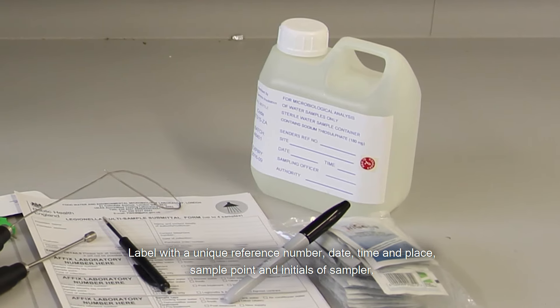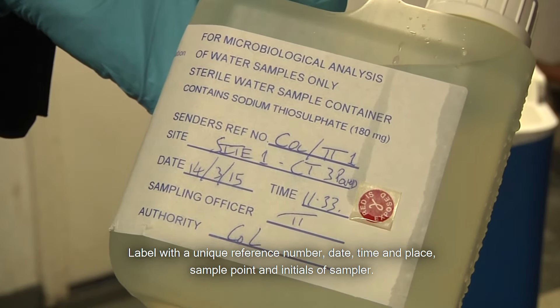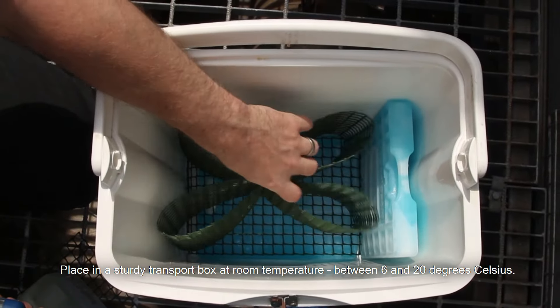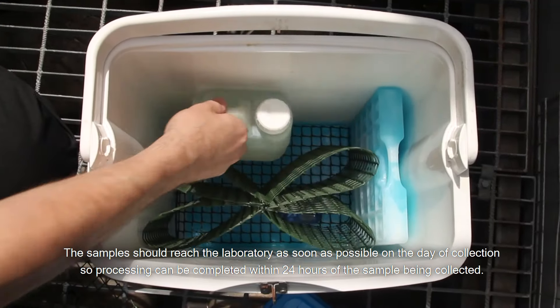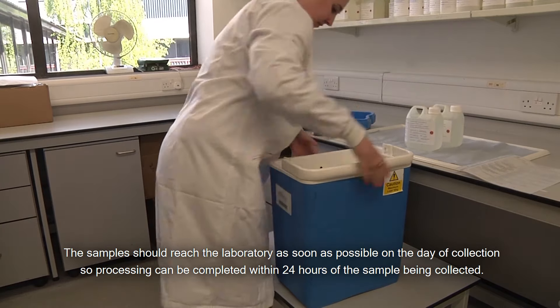Label with a unique reference number, date, time and place, sample point and initials of the sampler. Place in a sturdy transport box at room temperature between 6 and 20 degrees Celsius. The sample should reach the laboratory as soon as possible on the day of collection so processing can be completed within 24 hours of the sample being collected.